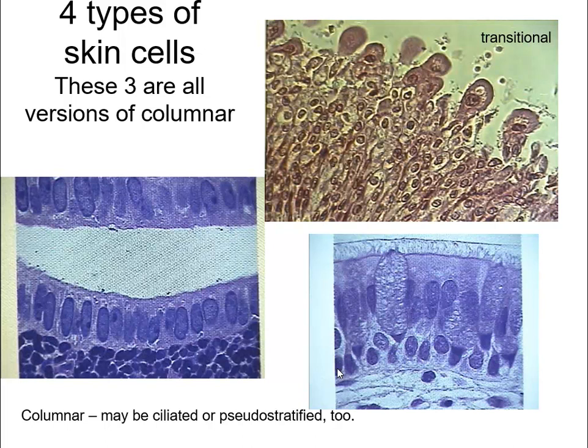Moving to the next type, we have skin or epithelial cells, and there are three major kinds. First are columnar cells — columnar just means column — they're tall and skinny. You can easily see the nuclei in those tall skinny cells. There's a row of them at the bottom and a row at the top with a lumen in the middle. You'll often find this lining the intestines or some other tube-like orifice.